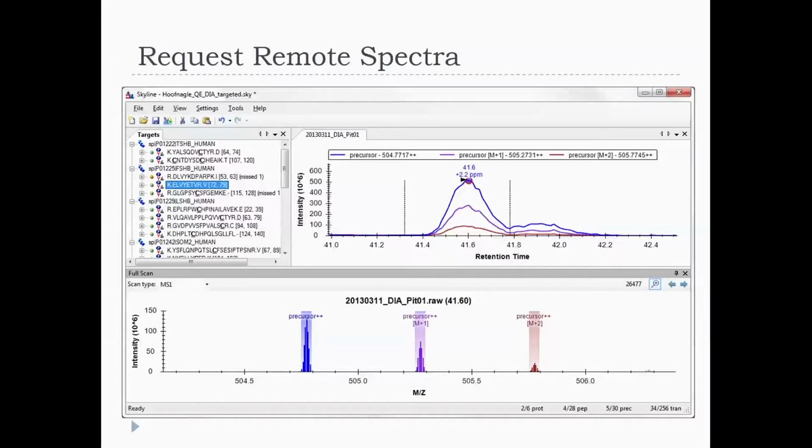Chromatography, yeah, so it might be tailing. Or any other guesses? An interference, that's a good guess. What else? Overloaded columns, or a friend of mine told me that sometimes you ask, is there a proline? Is it a doubly eluting peptide? Sometimes you see things come up and down. This might all be the same thing. So we've basically heard an interference, or that it's really part of the same peptide. Those are our two choices.